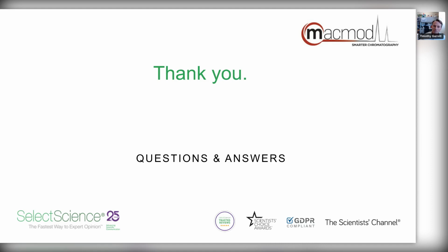That's great, thank you. Another question here is, the instrument gives 1 ppm accuracy. What ppm tolerance to use for data searching?